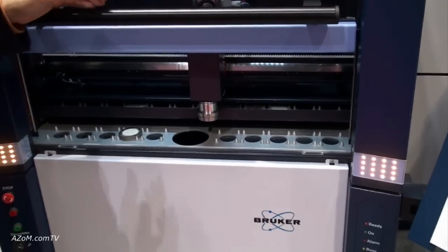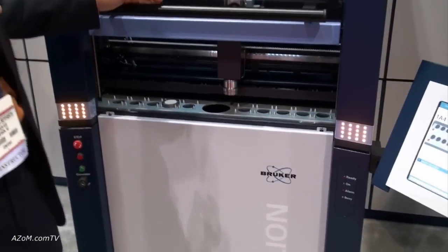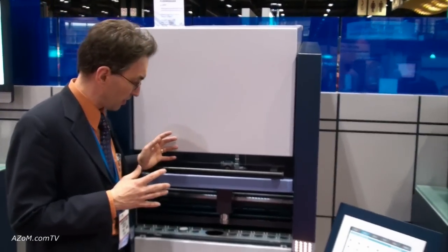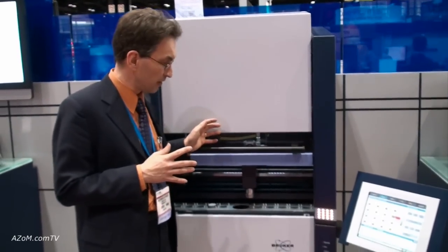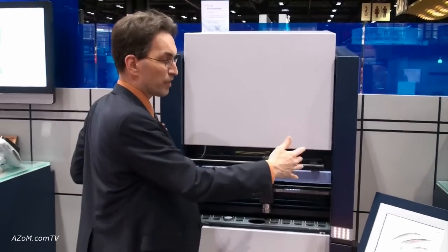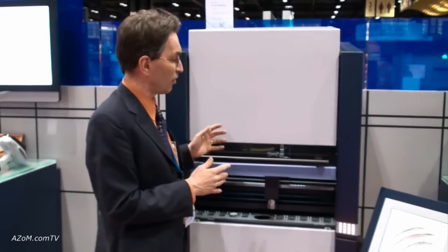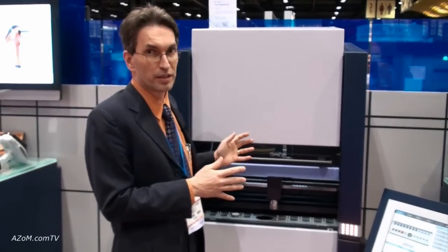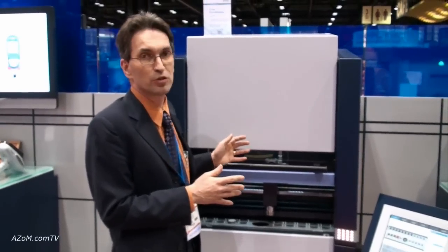This is actually the oldest part of X-ray technology. What is new is the size of this machine. Ten years ago, standing next to a machine like this, it would dwarf you — it would be about three times this size. Now we have a machine with a 4,000 watt tube and the smallest footprint in the industry: less than 1.2 square meters.